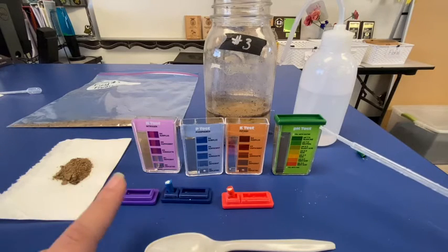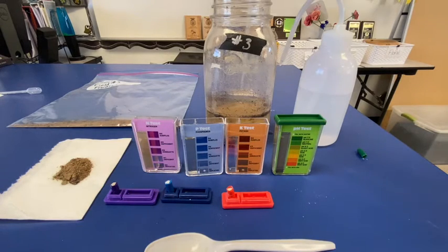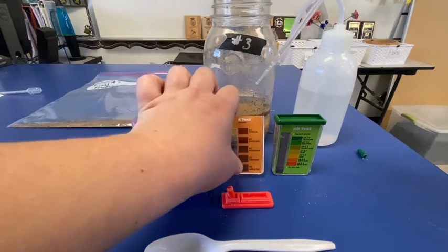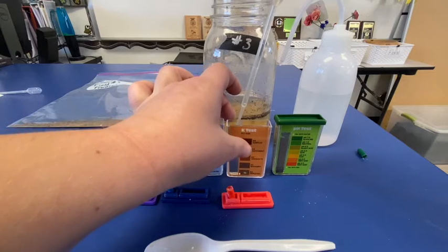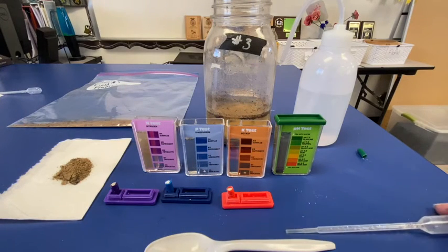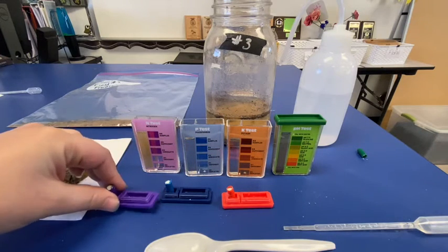I've already filled nitrogen and phosphorus with the substance, the soil water. I'm going to fill our potassium next. We're filling this to the fill line so that I can then put in the actual capsules, which will tell us what the levels are. So the levels of N, P, and K. And we'll dive a little bit deeper into essential nutrients here in the next week.